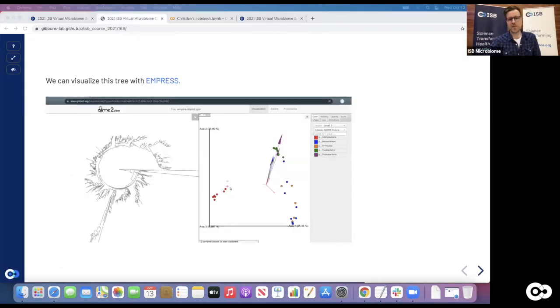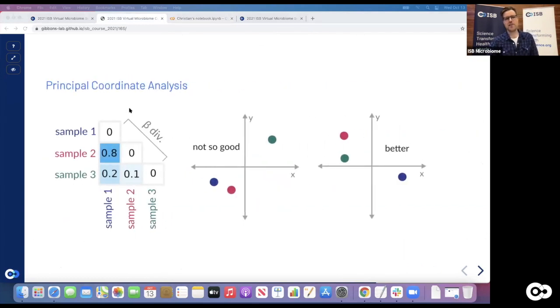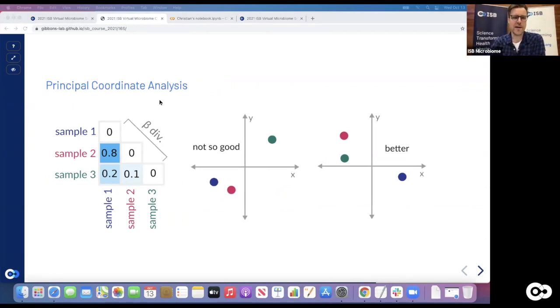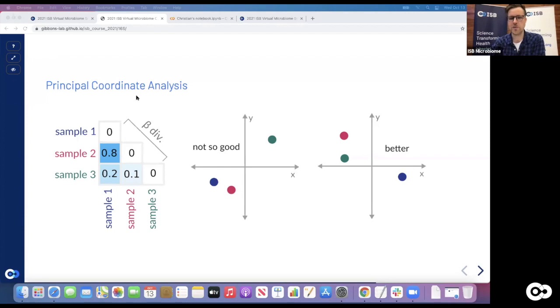So we have our tree, and now we also have our beta diversity estimate. That was calculated based on the tree using the UniFrac distances as we introduced them, and also using the weighted version which takes abundances into account along with phylogenetic similarity. So what does beta diversity actually look like? As I said, it's a distance measure between samples - for every pair of samples you get a distance assigned. If values are higher, samples are further apart. If it's zero - which is always the case for the distance between a sample and itself - it means the composition is exactly the same.